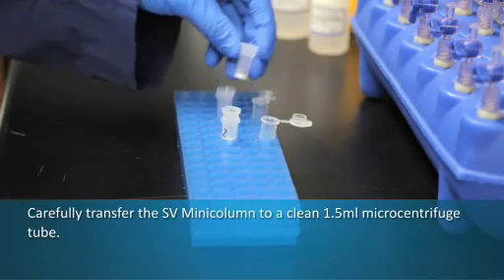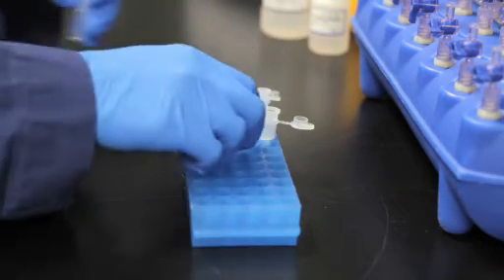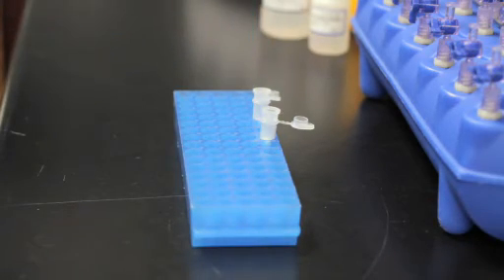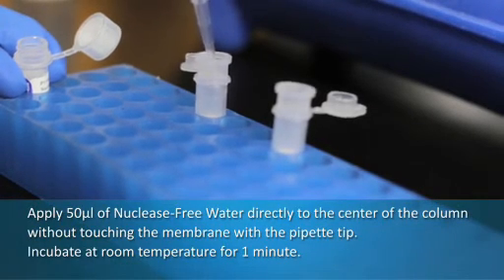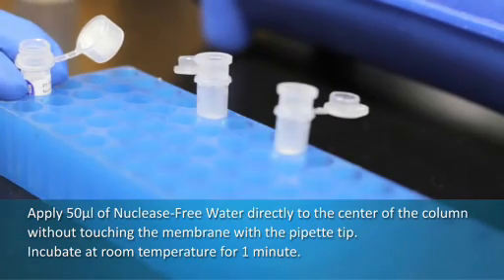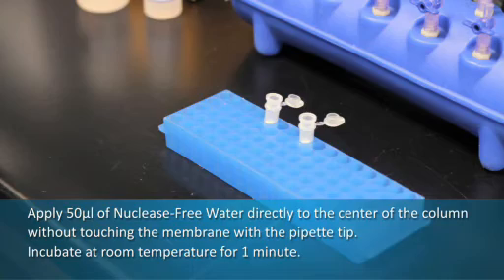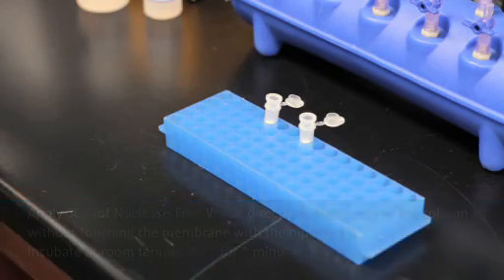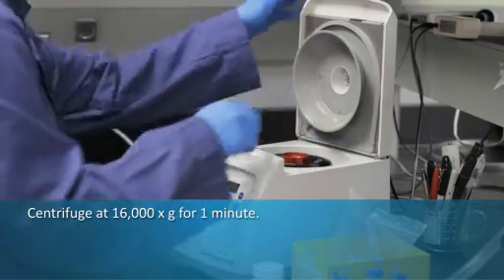Carefully transfer the SV mini column to a new 1.5 milliliter microcentrifuge tube, being careful not to wet the bottom of the mini column with the flow through. Apply 50 microliters of nuclease free water directly to the center of the column without contacting the membrane. Incubate at room temperature for 1 minute. Centrifuge for 1 minute at 16,000 times gravity.